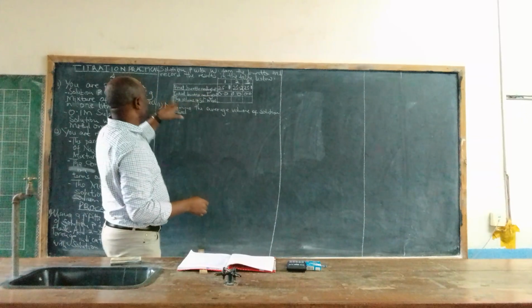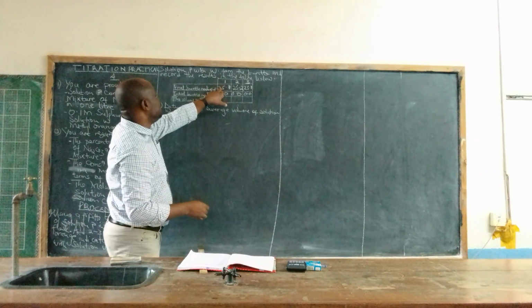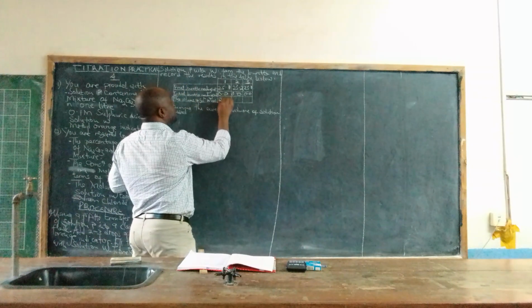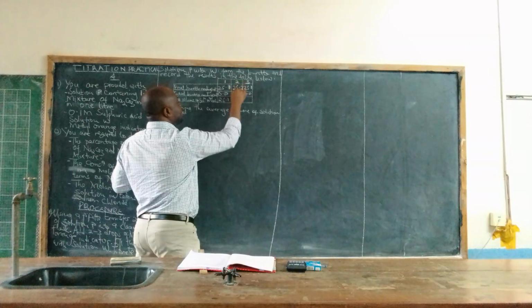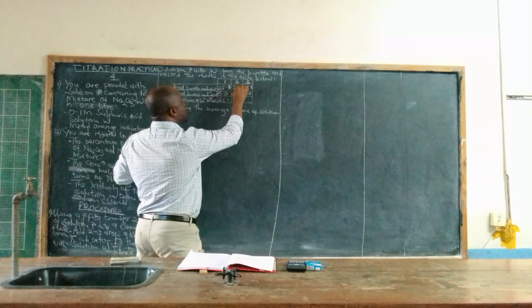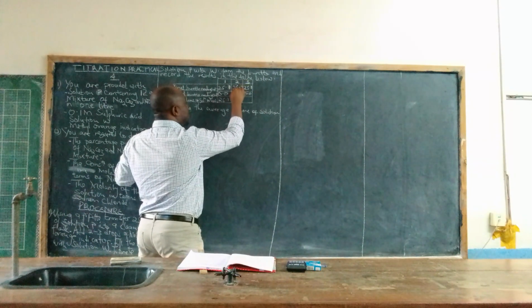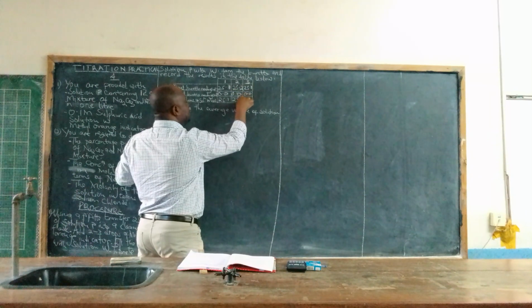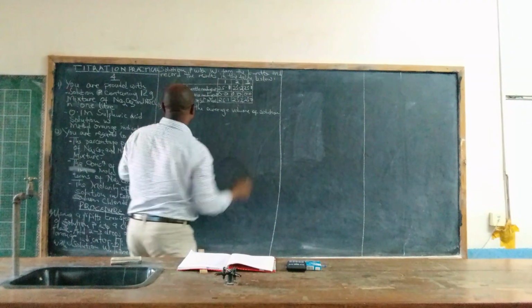So if we want to get the volume of the solution W used, we subtract the initial from the final, and we get 25.1. Also in column 2, we subtract the initial from the final, which is 25.2, and then we subtract 0, we get 25.2. The same for column 3, so we get here 25.0.